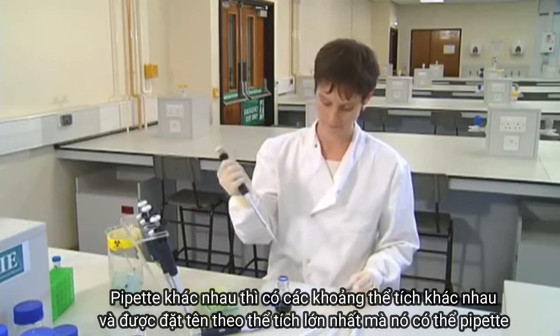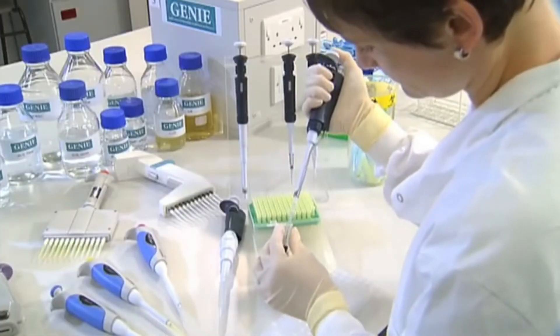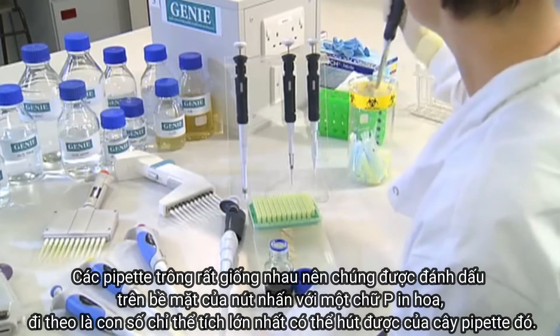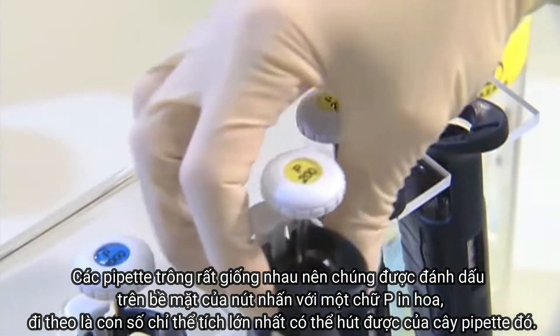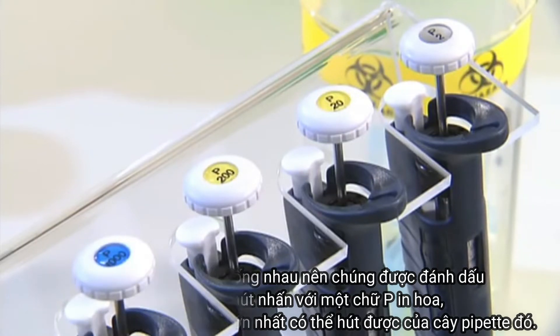Different pipettes work across different ranges of volumes and are named by the maximum volume they pipette. The different pipettes look very similar, so they're labelled on the top of each push button with a capital P followed by a number which indicates the maximum volume for that particular pipette.